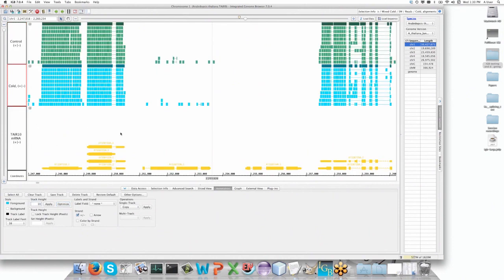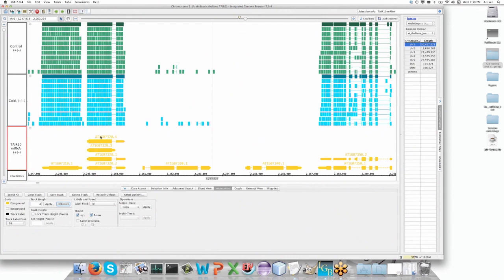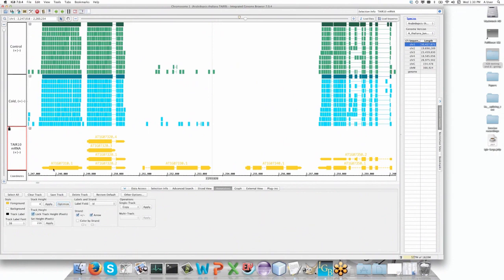Now in quite the opposite direction, you can see that this track only has 4 as the highest stack and it is set to 10. If I choose to optimize this, we get rid of the white space and it shows you exactly 4 high and an empty summary row. Now again, as I showed you, if you increase the amount of data, you can really start to push this stuff off the screen. And at least for the annotations, we'd always like to keep them in view.